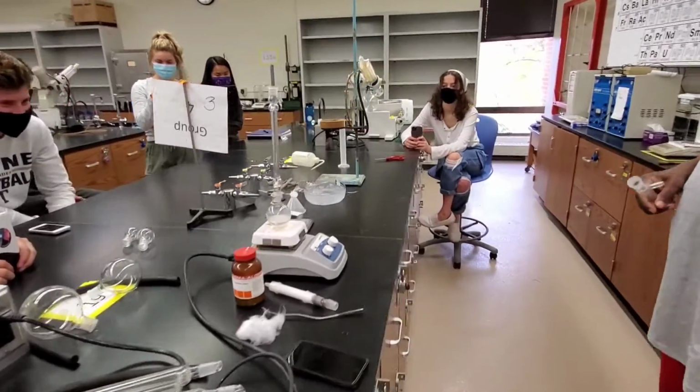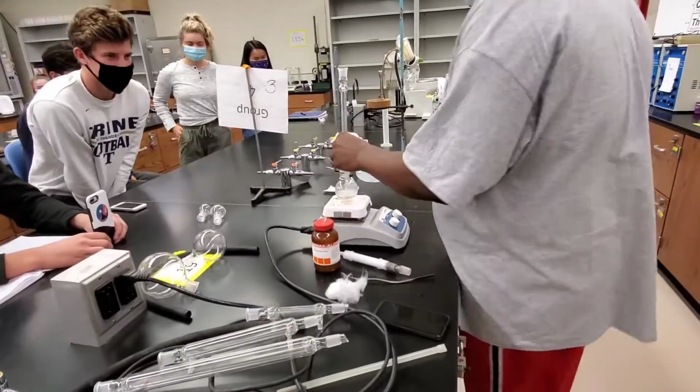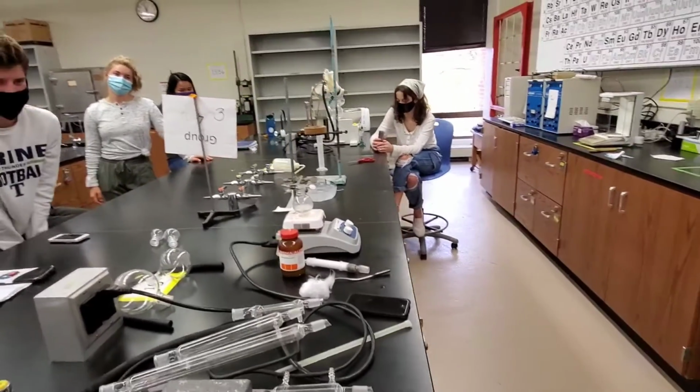So looks, oh, okay, yes, that's fine. Those are the condensers. Did you guys read up on the condensers and what they're used for? They cool down the evaporation. You guys got jokes, man.